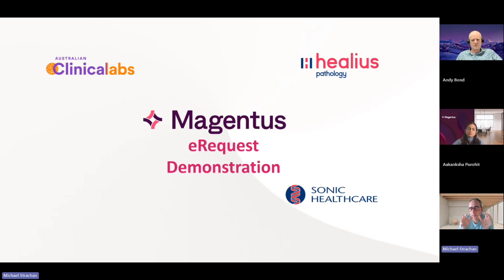It's key to really understand that it's very different from an HL7 messaging model where a message is delivered and then the job is done. We're doing a back and forth interaction between Magentus and our diagnostic partners. For today's demonstration, we're going to demonstrate Sonic Radiology's workflow, Healius pathology workflow, and ACL pathology workflow. Sonic also do have pathology as well. However, just due to time constraints, that's what we'll demonstrate today.